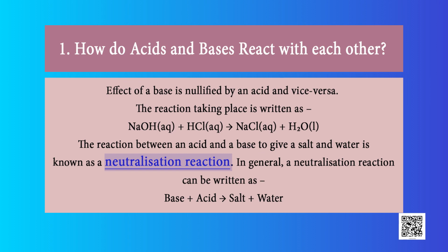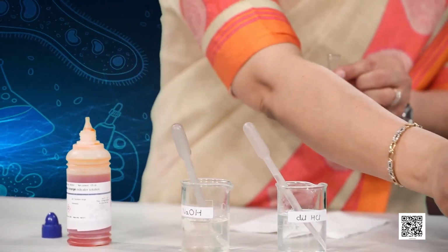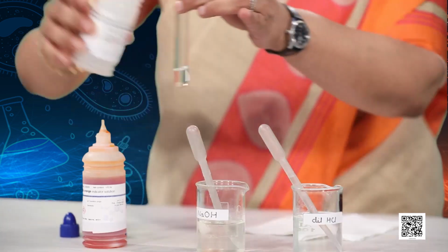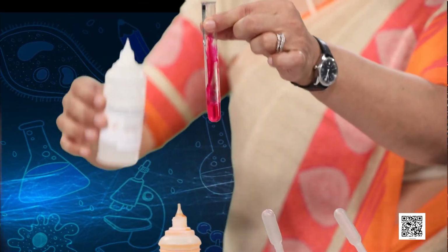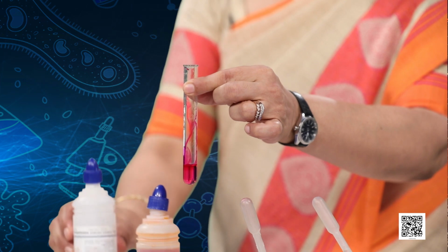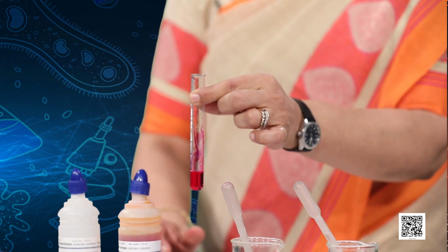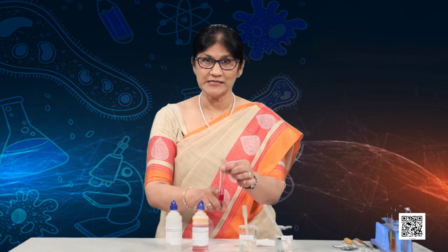Now let us do another thing. Let us take some sodium hydroxide solution. So this is sodium hydroxide, and now I will put some colorless indicator phenolphthalein to it, just one drop. And what are we expecting? Are we expecting a color change? Yes. So we have got a magenta pink color when phenolphthalein was added to sodium hydroxide, the base.